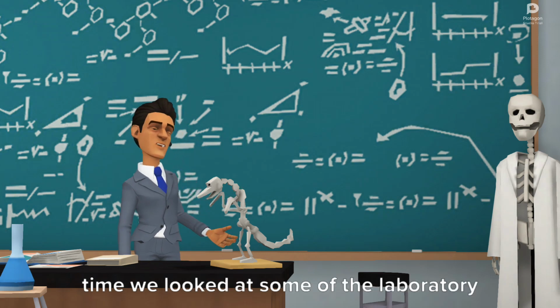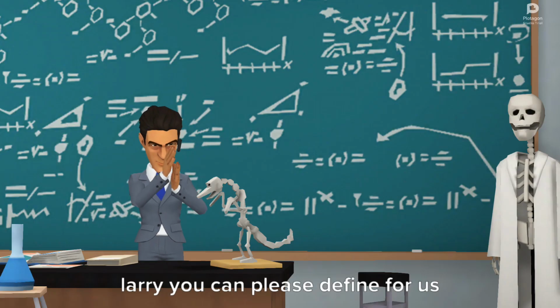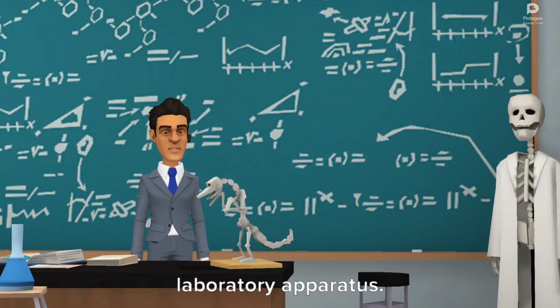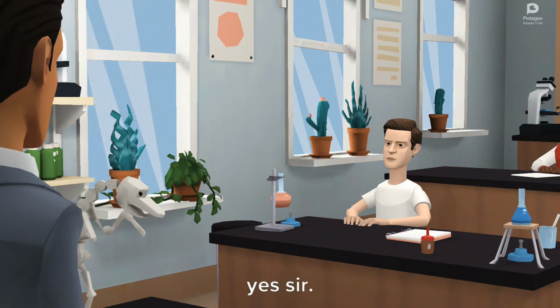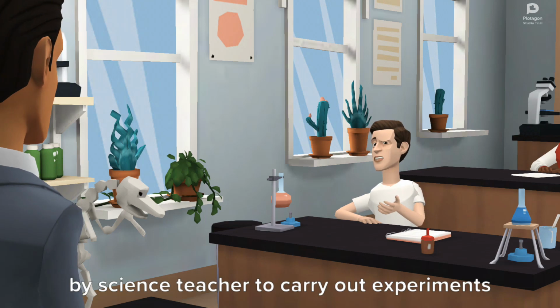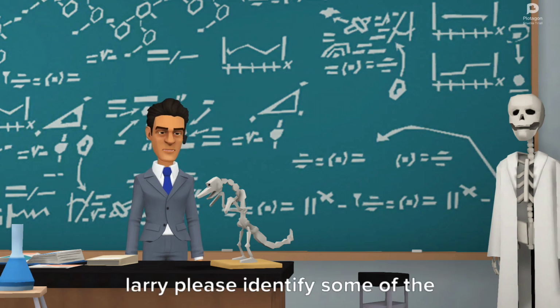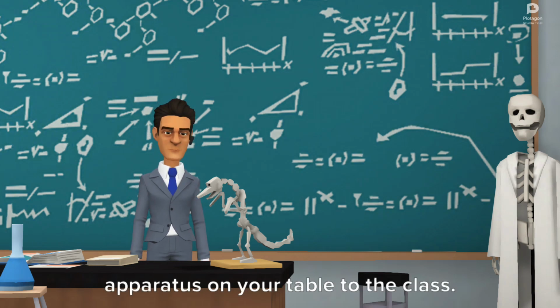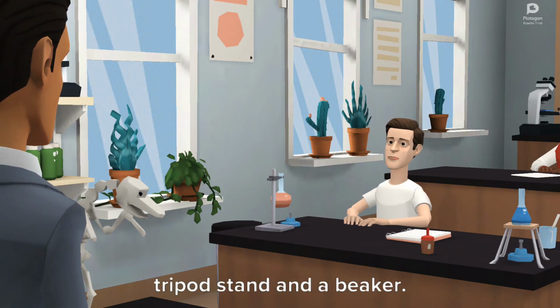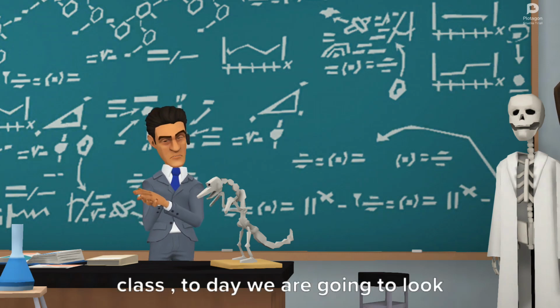Last week, we looked at some of the laboratory apparatus. Yes, sir, we did. Larry, can you please define for us laboratory apparatus? Yes, sir. Laboratory apparatus is any tool used by a science teacher to carry out experiments. Correct. Thank you. Larry, please identify some of the apparatus on your table to the class. Sir, I can see a Bunsen burner, a tripod stand, and a beaker. That is correct. Thank you.